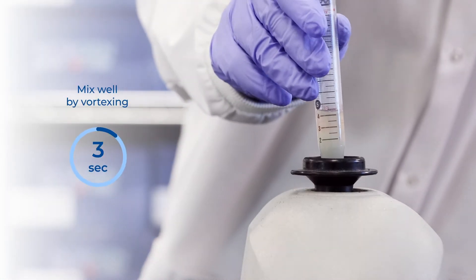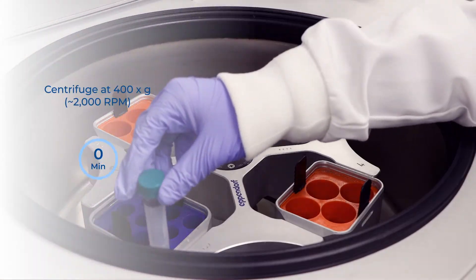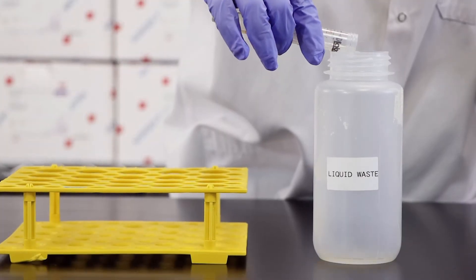Mix well by vortexing for 10 seconds. Centrifuge for 2 minutes at 2000 RPM. Discard the supernatant.